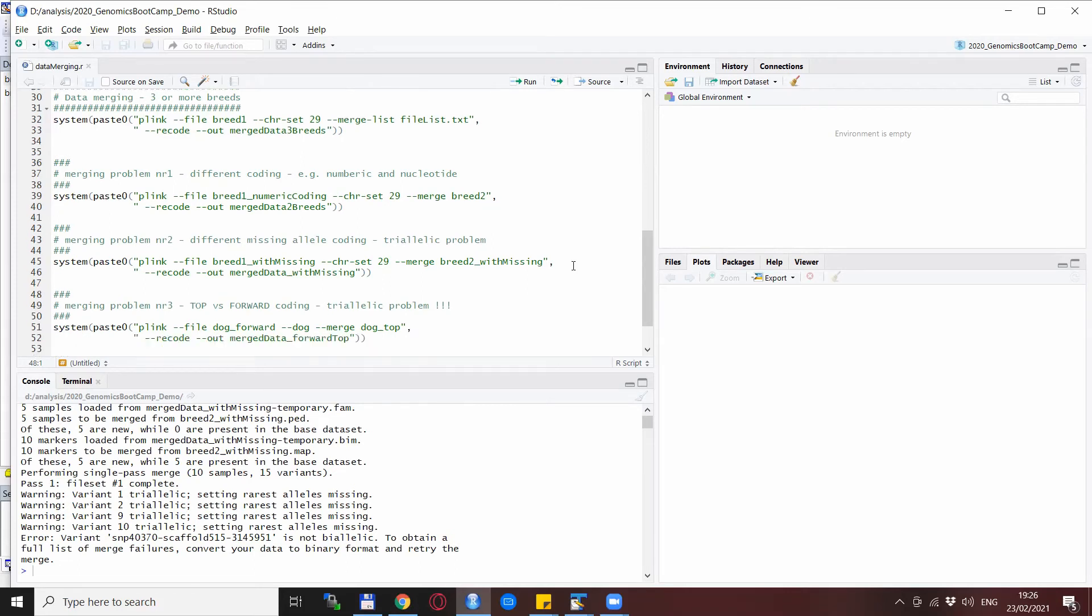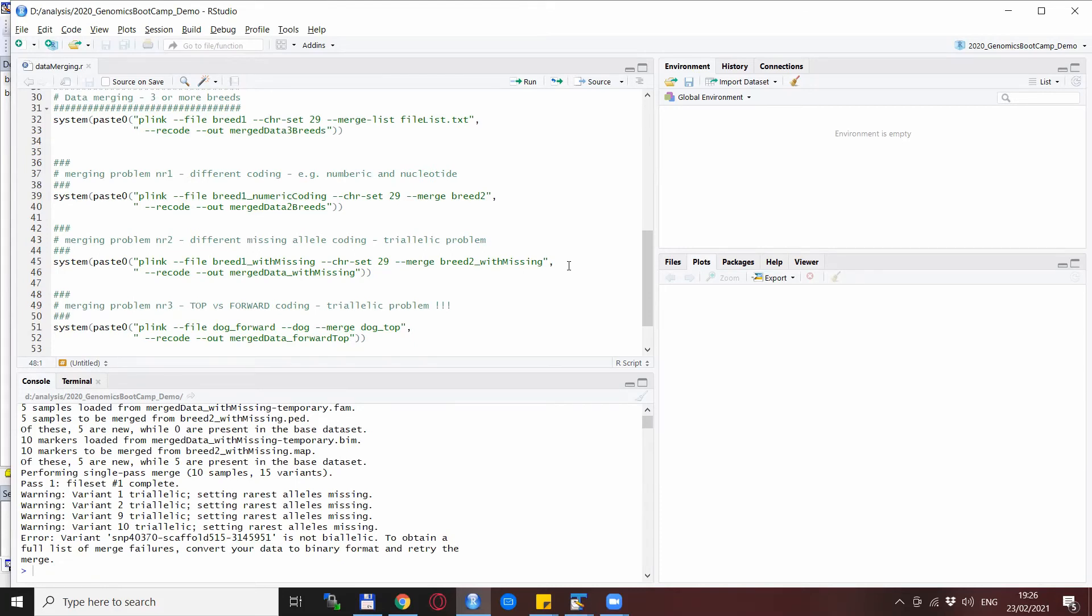And an even more sneaky problem is when you get two datasets where one is coded with the top format and the other in the so-called forward coding format. In this case both datasets are coded with nucleotide and also the missingness or the allele for the missingness is usually the same. So this is actually not a problem. This kind of setup is a bit more tricky to generate so I use some non-public dog data to demonstrate.